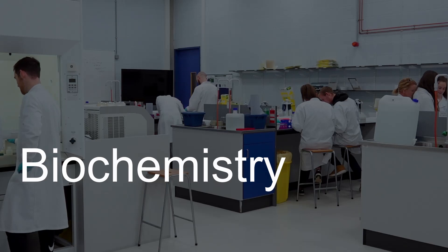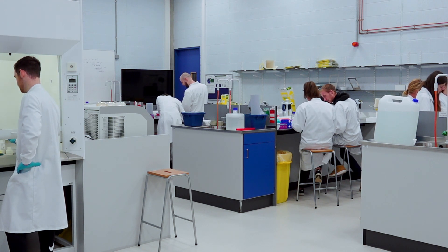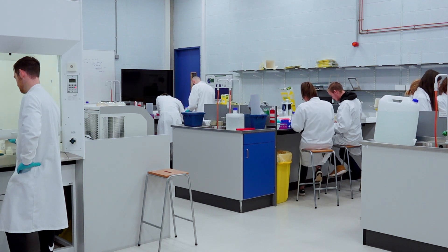Welcome to the biochemistry lab. This laboratory is used for biochemical practicals. The current class is a master's class in exercise physiology, and they're doing the basic foundation skills in wet lab biochemistry.